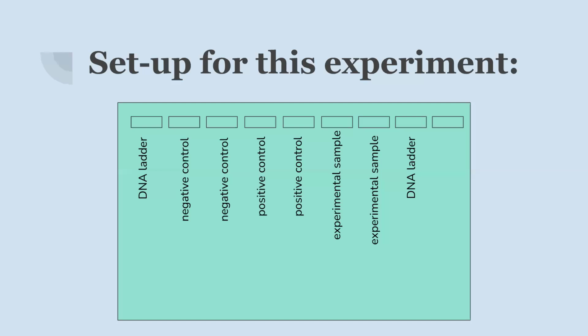And sometimes with banding, we can get something called smearing on gel plates. Have any of you ever heard of that before? Smearing on gel plates? Basically, it's whenever a band is so dark that, when you look at the gel plate, you can see a ray of light that's much thicker than where it's supposed to be. It almost looks like if you dipped your finger in some ketchup and smeared it across the countertop. There's a lighter section and a darker section, and sometimes it can make it harder to read. And that's the reason why you put so many samples in, right?